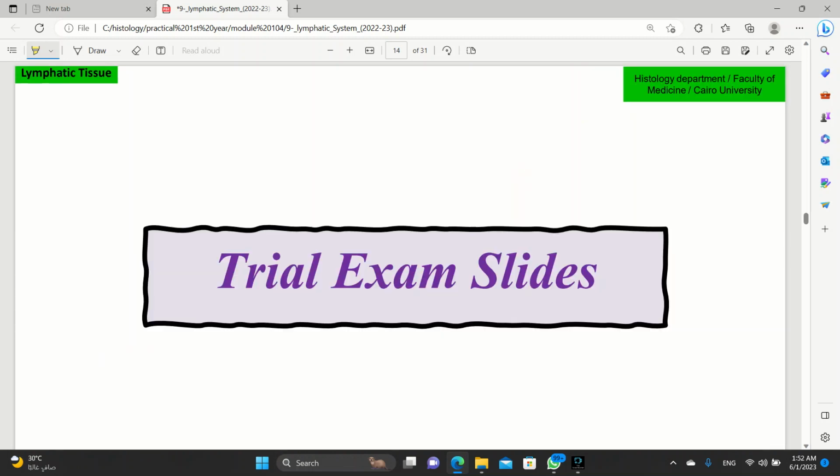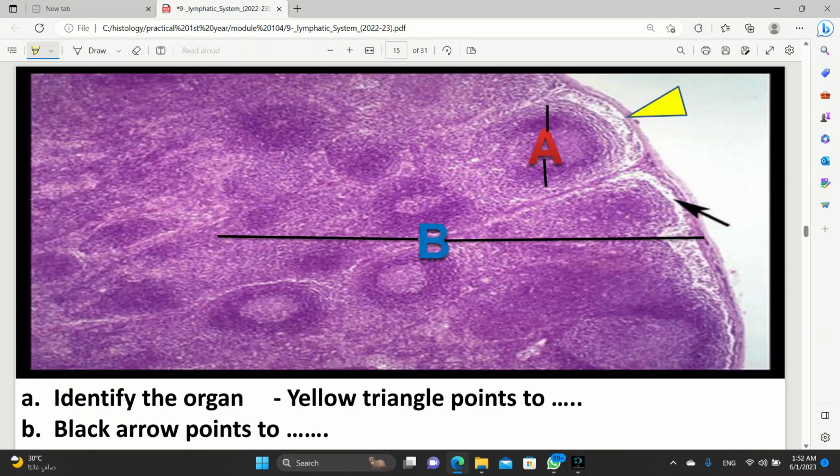Now we're examining. I was explaining with an open heart and very carefully. I didn't leave anything. Now, when we're in the exam, you're going to answer quickly. What is that? Oh, I can see a gradient. It's dark and getting lighter here. I said not to depend on that much because the gradient isn't really apparent, but I can see some dark purple here and lighter purple there. I said previously, don't depend on the colors that much, but they may help.